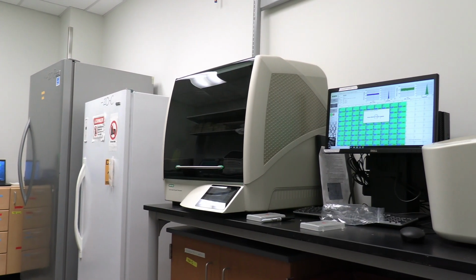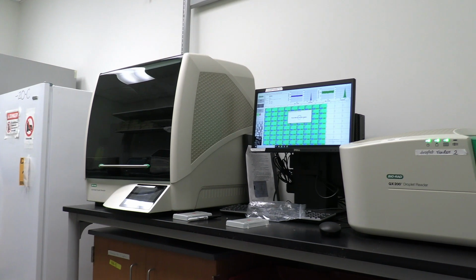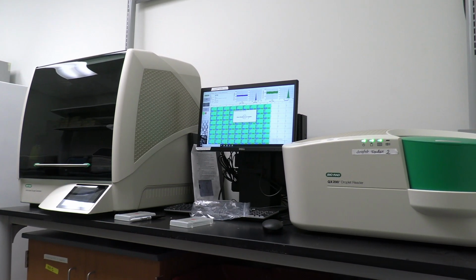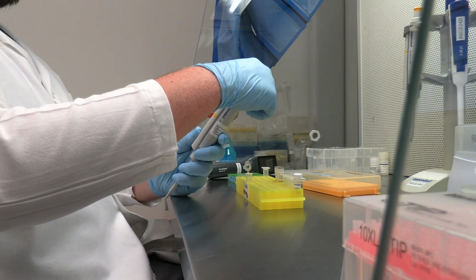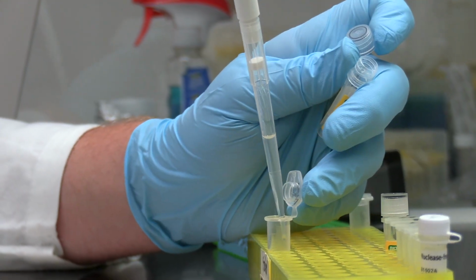After the nucleic acids are extracted and purified, target genes are quantified in the sample. Our group uses digital PCR, and specifically droplet digital PCR. This method uses a water-oil emulsion to form partitions that separate the nucleic acid molecules into individual droplets. SARS-CoV-2 is quantified in each wastewater sample using a one-step RT-ddPCR assay.